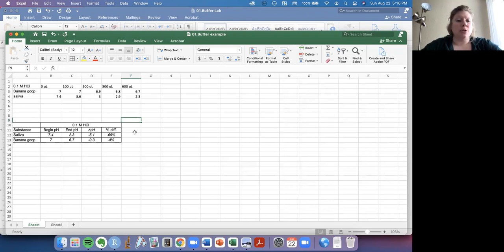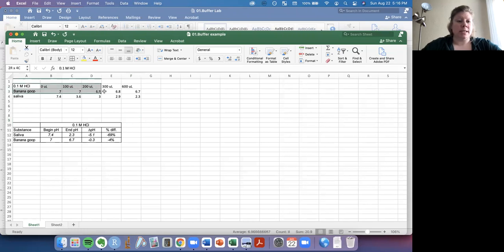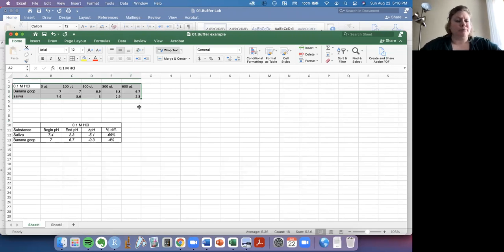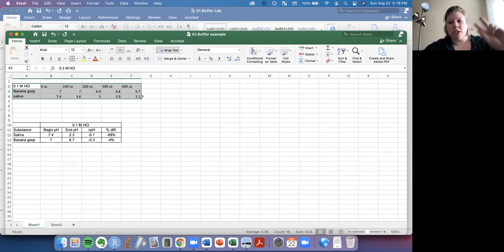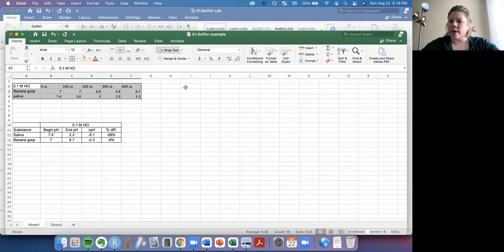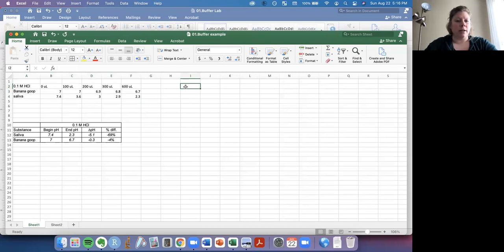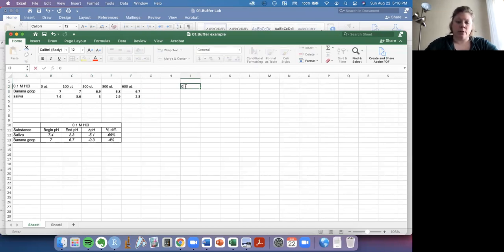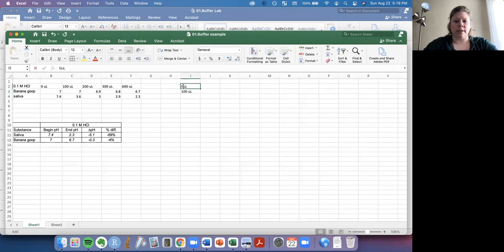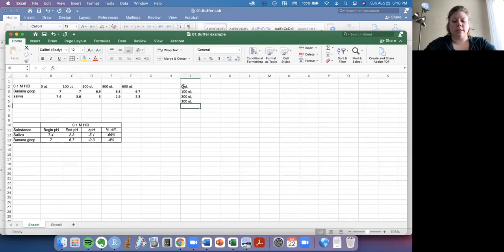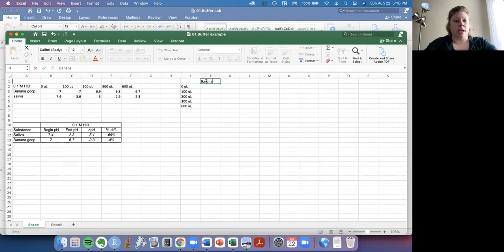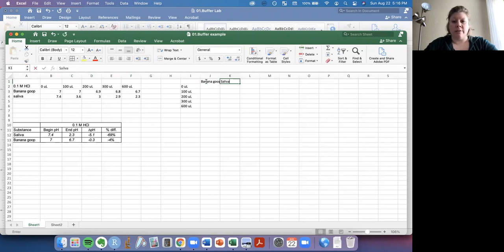Okay, so the next thing I'd like for us to do is to use this data, this table of values that you collected, and use it to make a graph. And so in order to do that, we actually have to sort of transpose the data, because this table is not the best way to format to make a chart in Excel. So I am going to, on the left side here, say zero microliters, 100 microliters, I have to put the spaces in, 200 microliters, 300 microliters, 600 microliters of HCl that was added. And then up here we'll say banana goop. And here we'll say saliva.